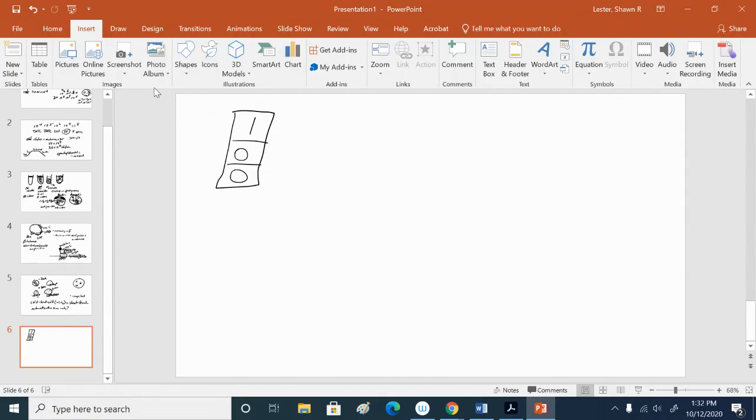So somebody say it. Are you able to repeat the question? If this is the 0.5 to 10 microliter pipetter, what is it set for? What volume?